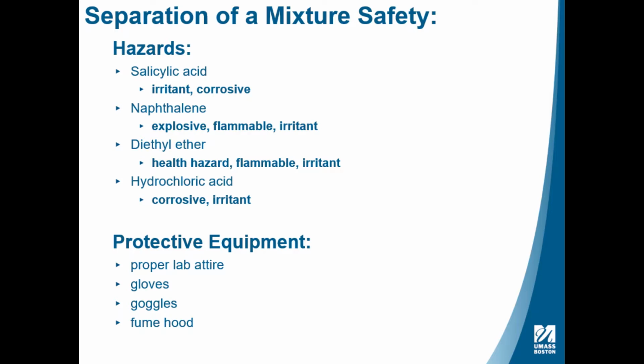Concentrated hydrochloric acid is highly corrosive and a strong irritant. It will cause chemical burns if spilled on unprotected skin. Due to all of these hazards, we will be working in the fume hood, and we will be wearing proper lab attire, gloves, and goggles.